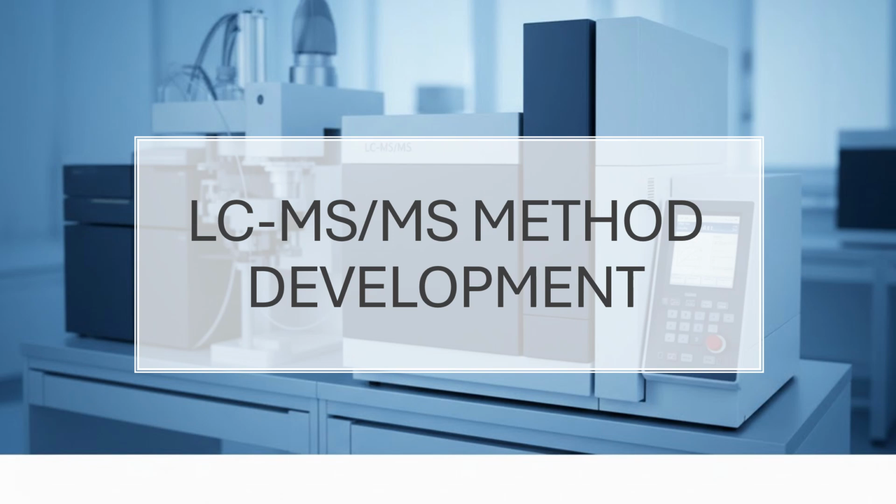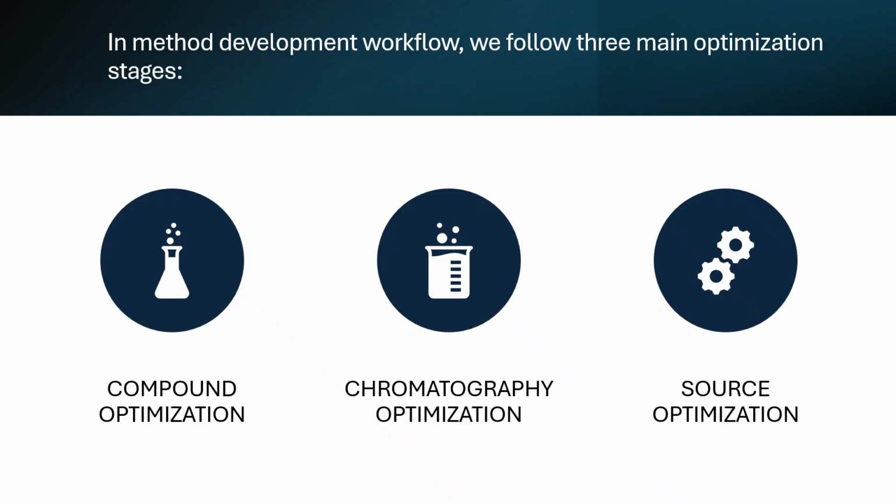Hello everyone. Today I'll be discussing a critical aspect of LC-MS/MS method development, that is compound optimization. This is the first step in developing a robust and sensitive analytical method, and it forms the foundation for all subsequent optimization steps.